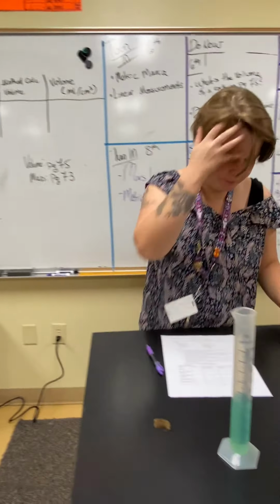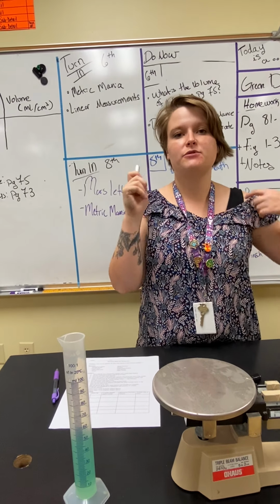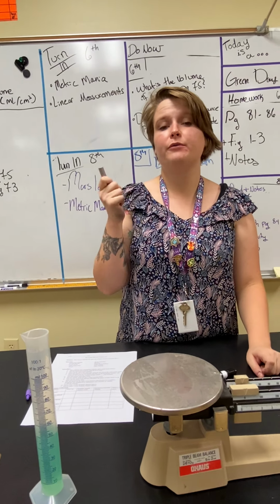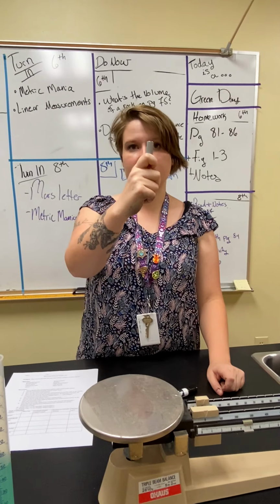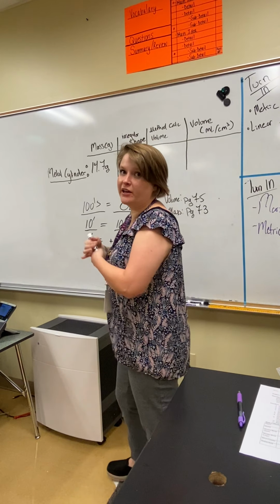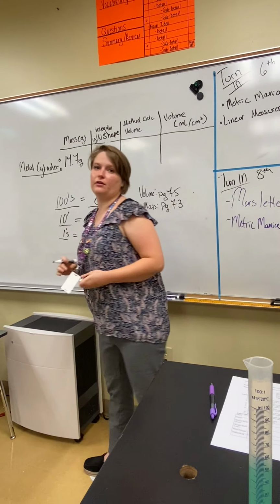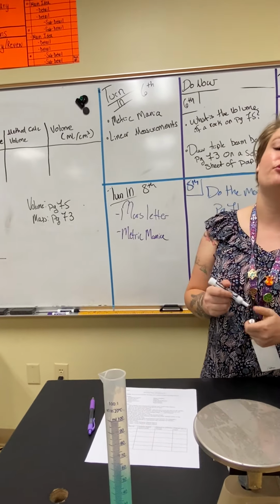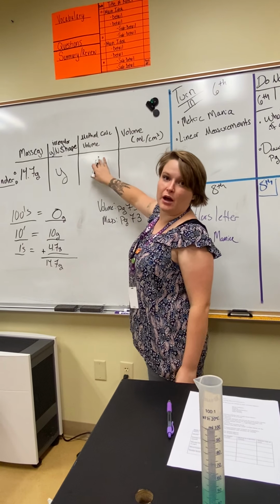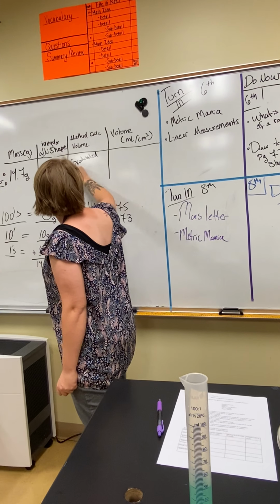Now, let's talk about volume. For us, there's two ways to calculate volume. One is length times width times height. You only use length times width times height if you are dealing with some sort of cube. However, this is a cylinder. So for us, you have a section that says, is it an irregular shaped object? Yes or no? Put yes for the cylinder. If you have to use the liter method, it is an irregular shaped object. So the method that I'm gonna use for this object is going to be the graduated cylinder method.